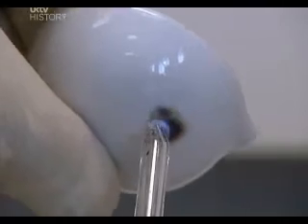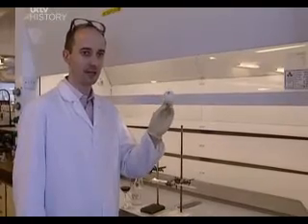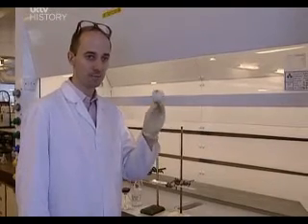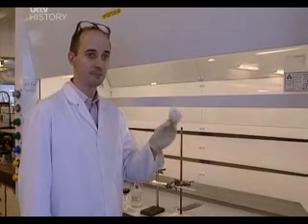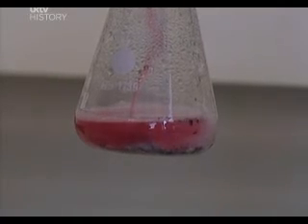The poison produces a stable, silvery metallic deposit. And this is the clincher. We have a thin layer of metal on our porcelain dish. This proves that there was arsenic in the wine, and this became the poisoner's downfall. The Marsh test was still used until the 1970s.